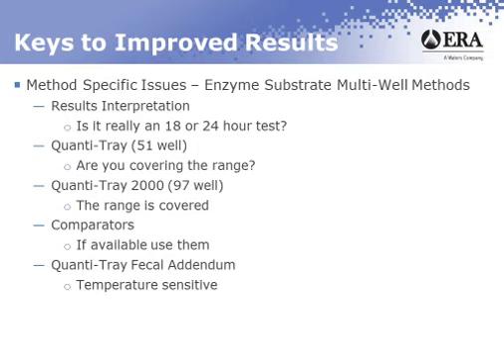Make sure that the trays are incubated facing up. And remember that you're looking for a color change only. You're not looking for fluorescence. These things will not fluoresce under those conditions. The reason we tell you to incubate them facing up is because the wells can trap water, and that water can get hot and it can cook your bugs.